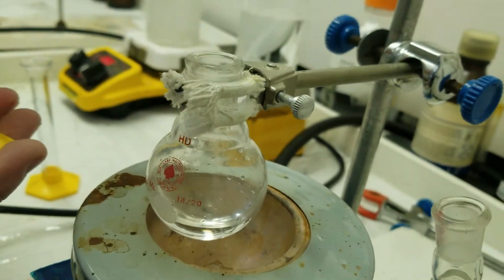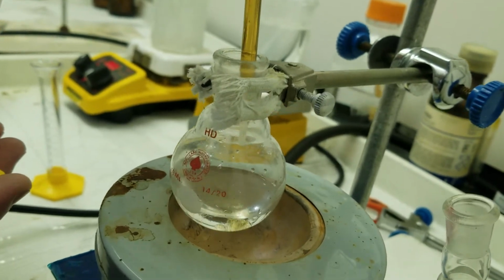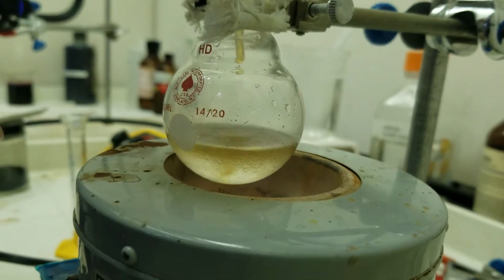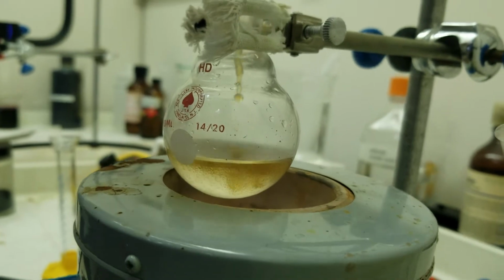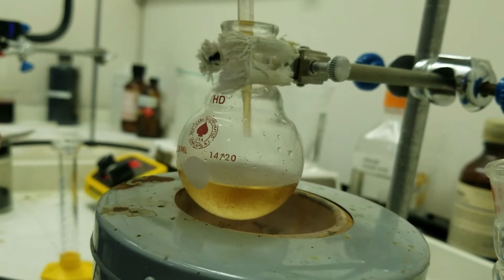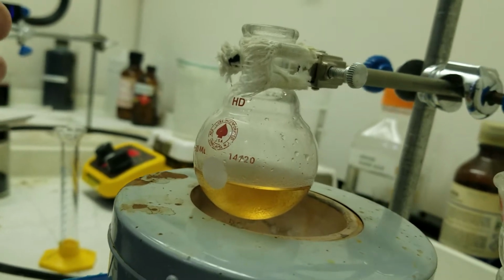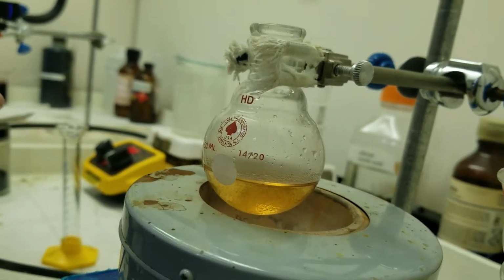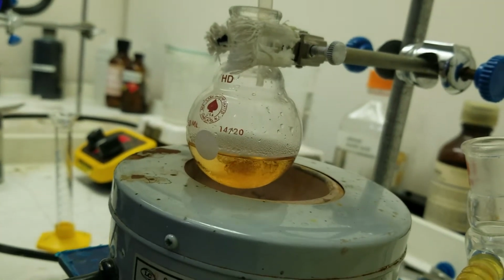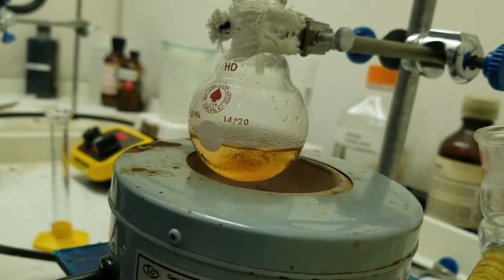Okay, so we're supposed to add this dropwise. You see it's kind of bubbling down in there. And I'm going a little bit on the fast side, trying to mix it as I go. If this was really good aniline, it would actually be 100% colorless, but we're going to worry about the color later when we do the decolorization step. To make perfect aniline, you have to actually distill it right before you use it.